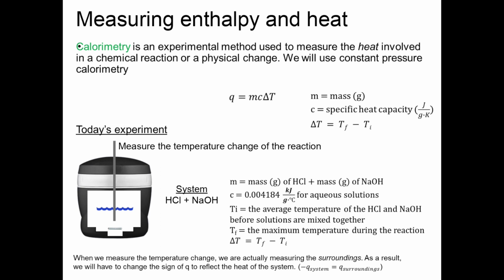Using those principles and what we know about calorimetry, we can apply the definitions and whatever we record to the Q equals mcΔT equation. What that is built up of is Q, which we talked about before, that's the calculation for heat, and it equals m for mass in grams, c, which is the specific heat capacity of your substance, and then ΔT, which is the change in temperature. So one thing to note about specific heat: while mass and ΔT you collect, c, the specific heat capacity, is a constant, but again, it's dependent upon what substance you're looking at.